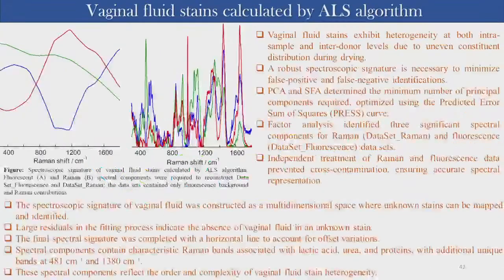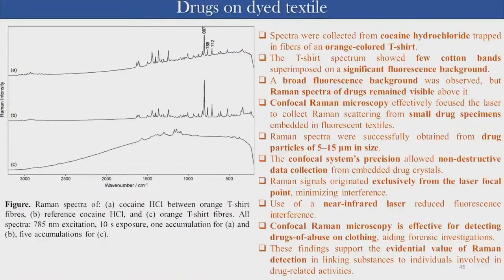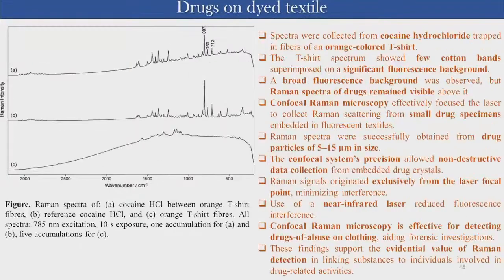So another spectrum I think I have. This is also, you see the fluorescence background. What kind of fluorescence background, it is not at all a good spectrum. But after many corrections, you will see that a nice spectrum comes. So this is with background, without background. You do some corrections and then you see this one. So background correction is necessary, as Professor Hiramasu also said.